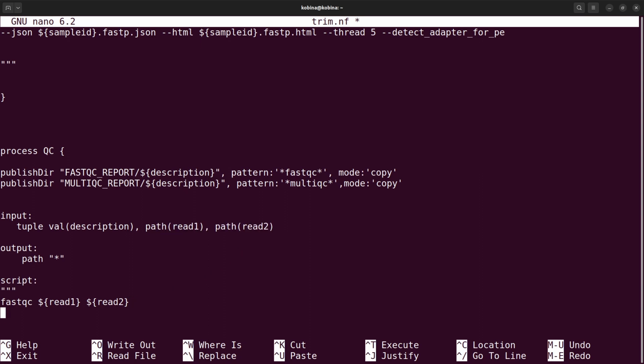After running fastqc, we have to run multiqc. So it's *fastqc*. But with multiqc, what happens is that it tries to clean your files. And so in some cases, if you have files with some names in common, it will lead to conflict, and one file will override the other.